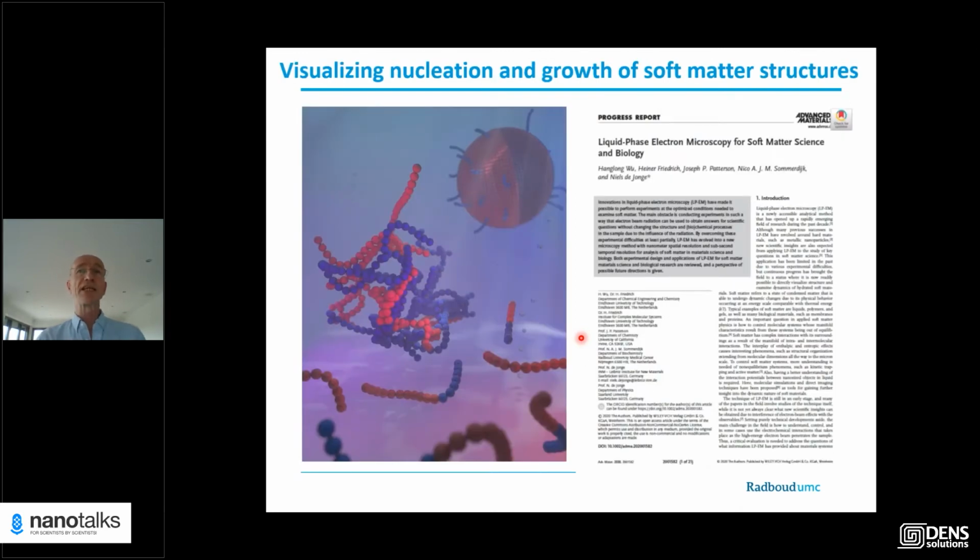I now come to the second topic of my talk, in which we use liquid phase electron microscopy. That is where we started to look if we were able to visualize organic materials, purely organic materials.